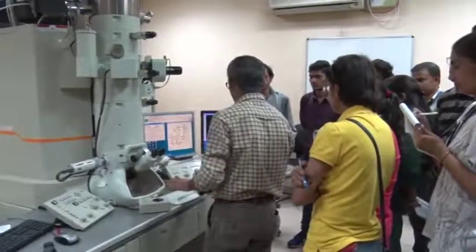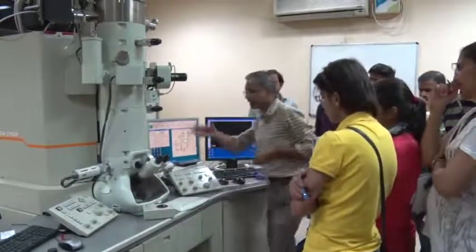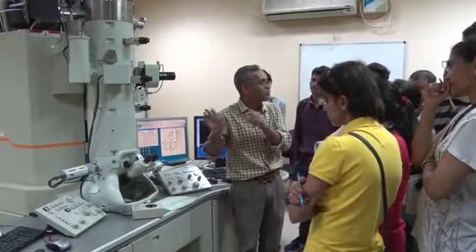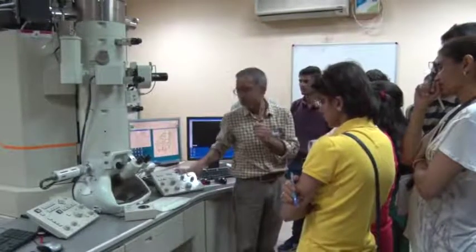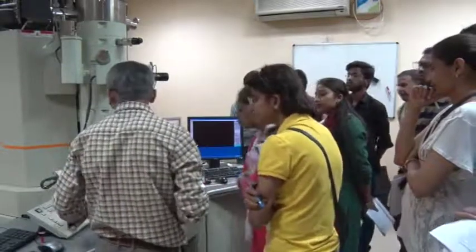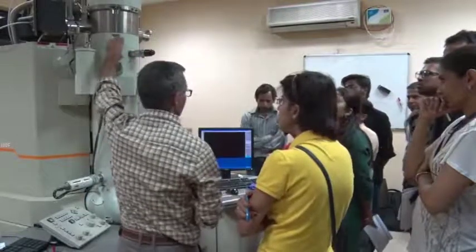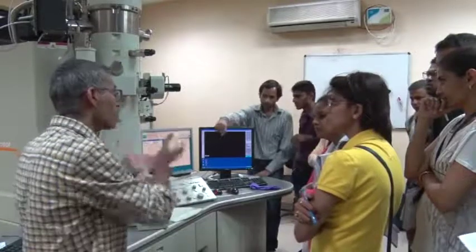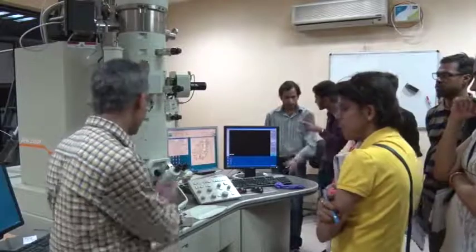So I think with that, now this is fine that there are lenses and apertures and all that, but as such they will be of no use. We should be able to control them somehow. So I will briefly explain some of the knobs that we will use. This one is heavily used. This is called the brightness, and this is related to the condenser lens. So if you want to have a parallel illumination or focused illumination, we play with this one. Yeah? I will show you also practically in a few minutes.